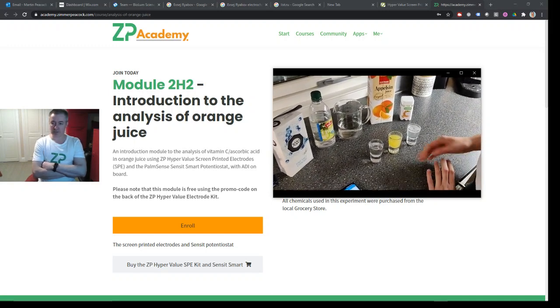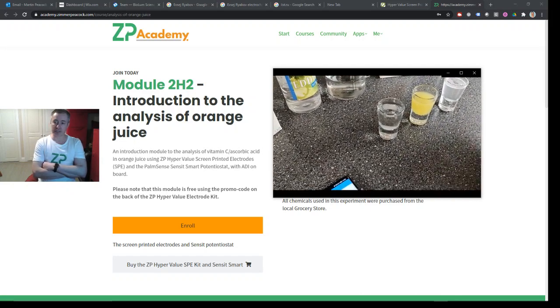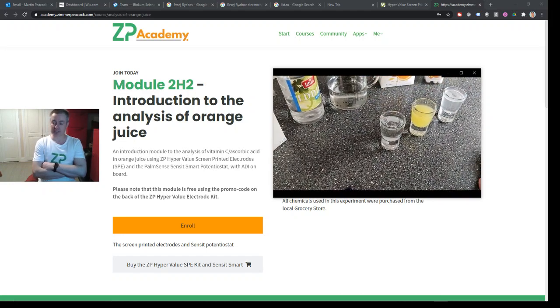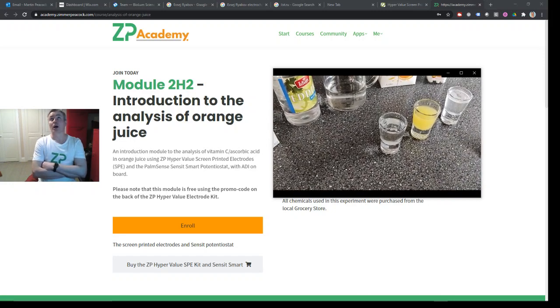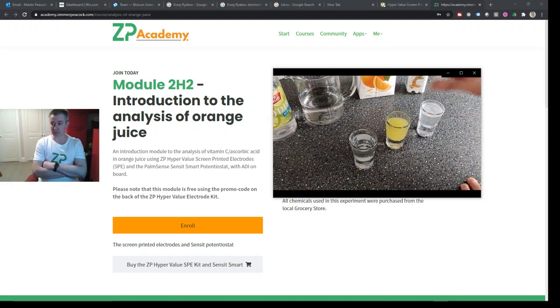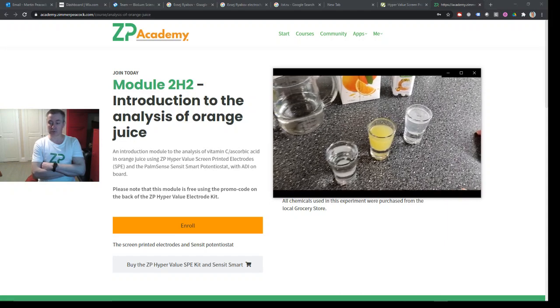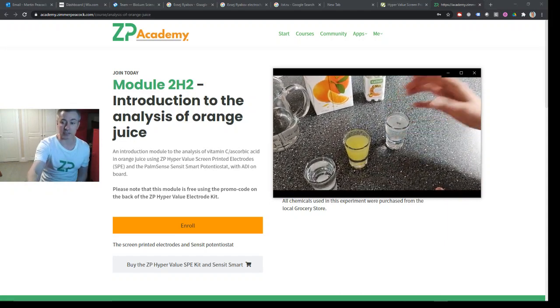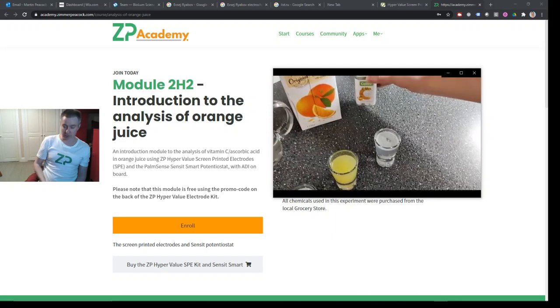In the video the ZP engineers test three solutions: one is just vinegar, one is vinegar plus orange juice, and one is vinegar plus a vitamin C tablet. By comparing these three solutions, we're able to show that orange juice has a very large oxidation wave using a technique called cyclic voltammetry. Using the effervescent vitamin C tablet, we're able to show that this is actually due to ascorbic acid, which is well known for being oxidizable at screen printed electrodes.